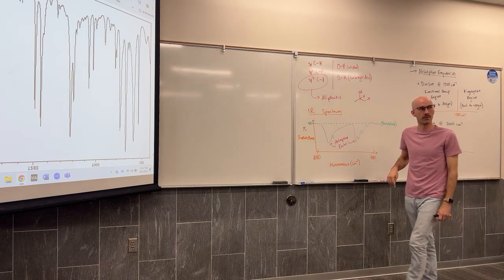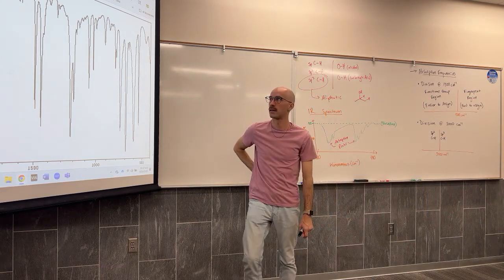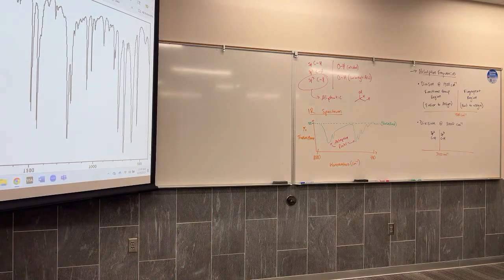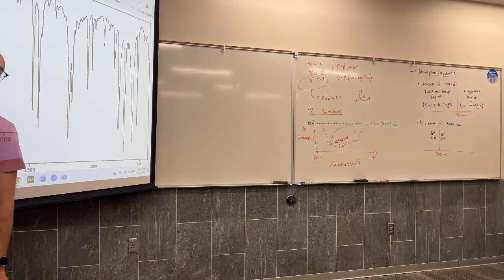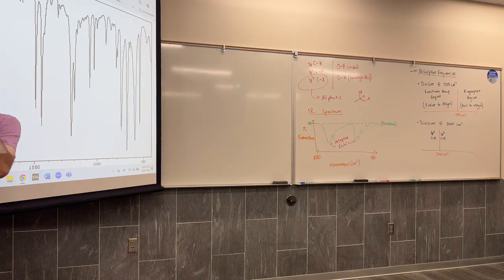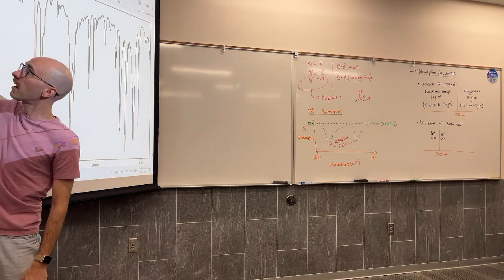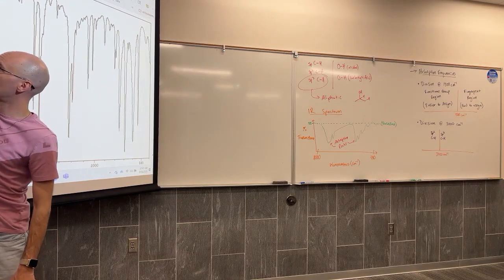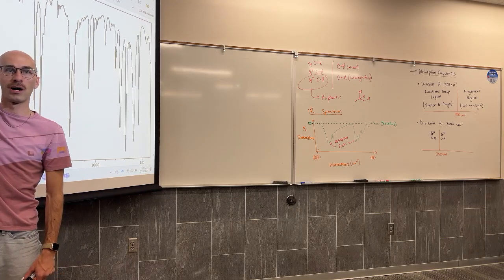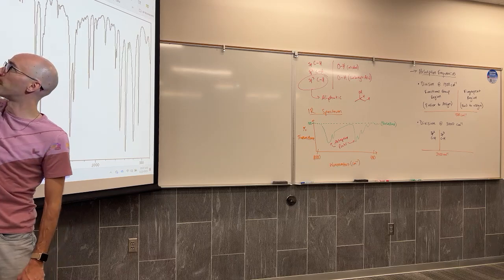Here's the IR absorption spectrum for the thing that we looked at yesterday, benzyl bromide. Here's 3,000, and if you follow this line up, it's so close, right? Especially those of you who are seeing this type of spectrum for the first time, I doubt that you would look at this selection of peaks and say, those come from different bonds, or even say that they are separate sets of peaks.